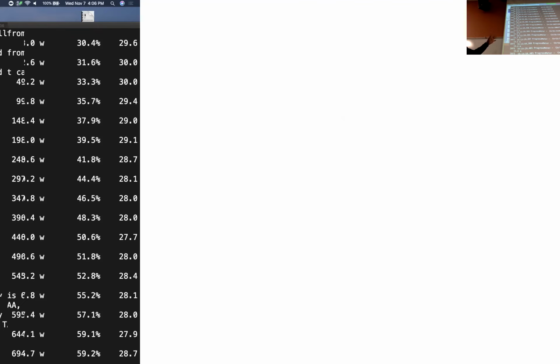So the GATK type of SNP callers are also robust in that way. And that's just another layer of filtering that helps you to generate a higher proportion of quality reads. Yeah.